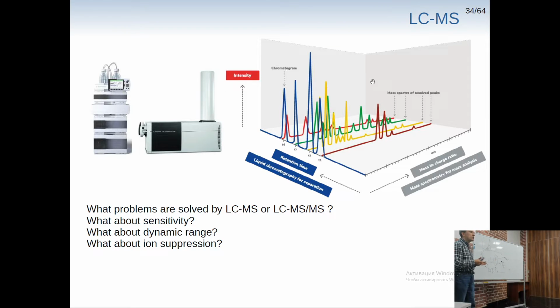But you can see that this approach already has a lot of drawbacks. For instance, our green one is the one that is most abundant, right? And we will try to fragment it here. And then this one starts to grow, and you will try to fragment it here, which is not optimal. Then you will have your blue one.